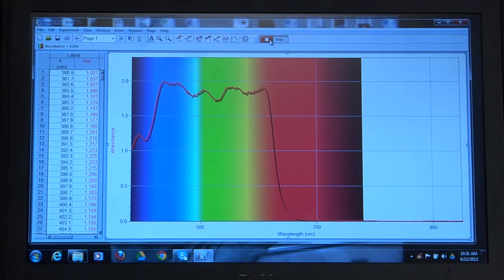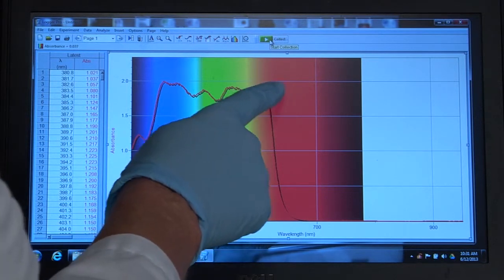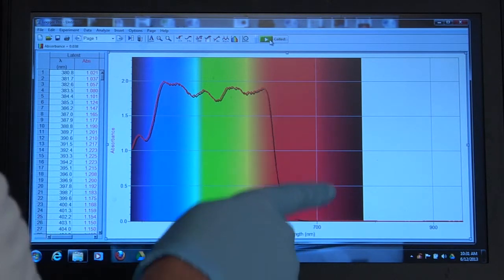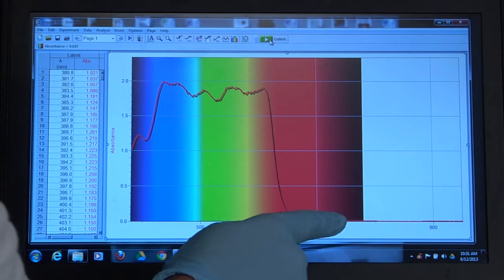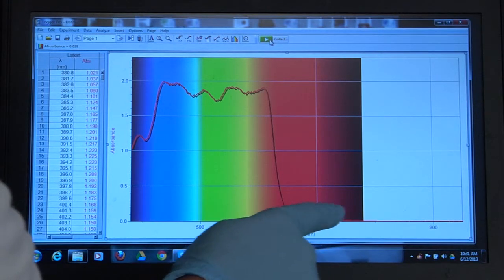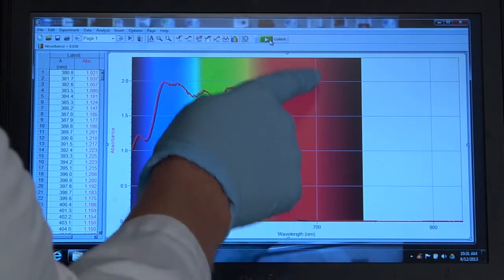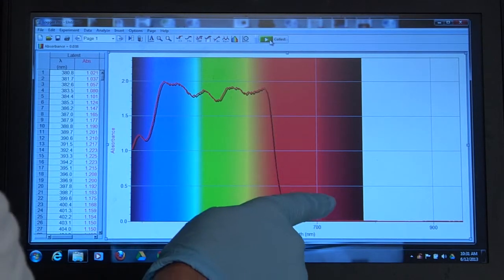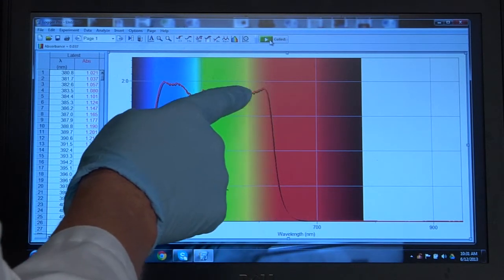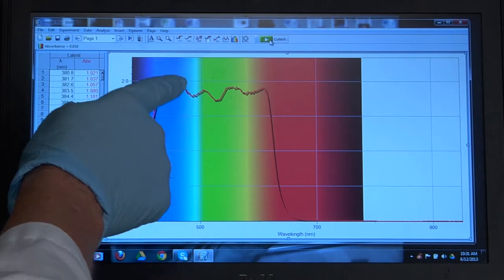And what you can see is none of it is being absorbed. So that means all of the red is being transmitted. Yellow, green, and blues are being absorbed.